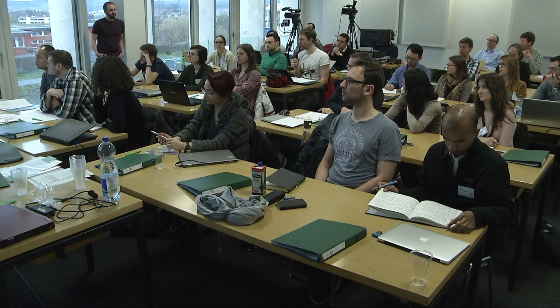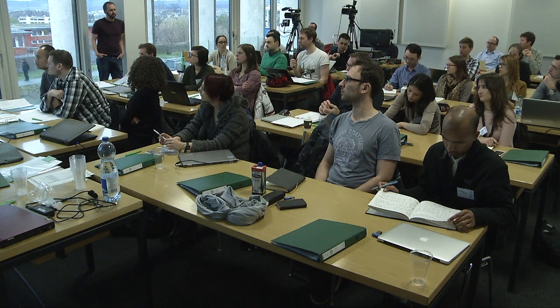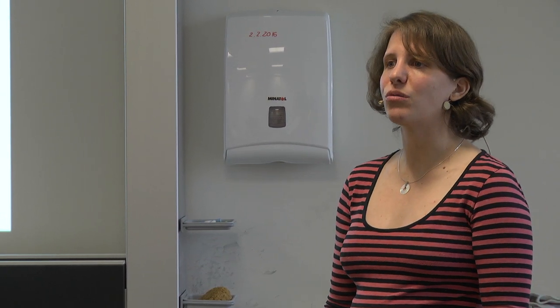What about taking the median? Sure, you can also take the median. I mean, in SRM you rarely have more than 3 peptides anyway, but yeah, you're right, it could make a big difference. I guess this is also there. There is no right or wrong way of doing it, I'm afraid to say.